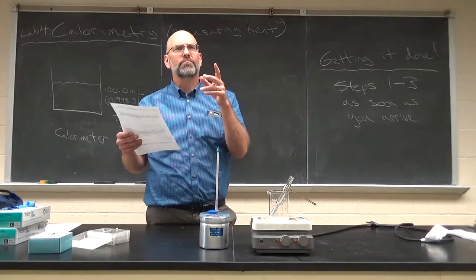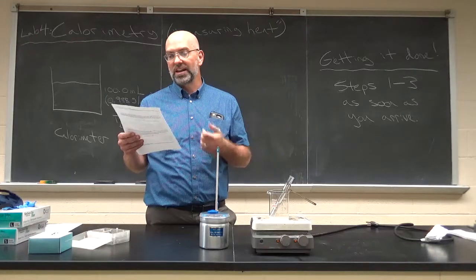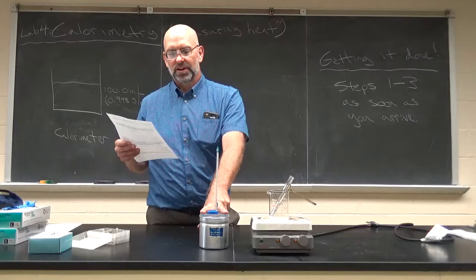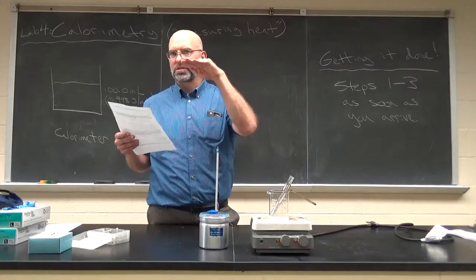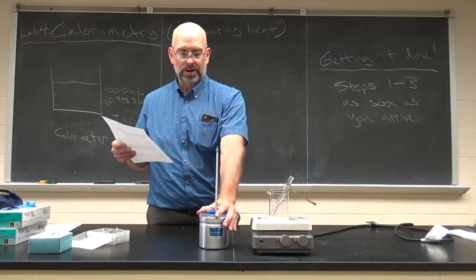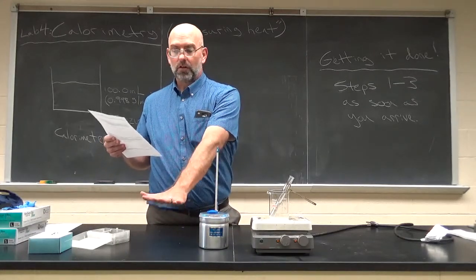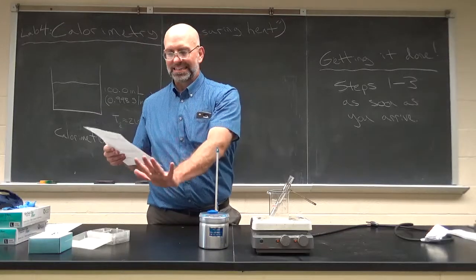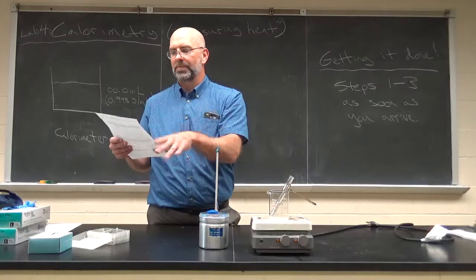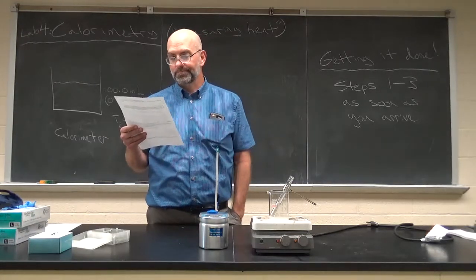Now, you can use tap water at the ends of the benches. That's perfectly fine. I don't really need to provide that to you, but you want to get that in here quickly so it has a chance to equilibrate to room temperature. So this is going for 15 minutes. Get your water in here. In fact, what might be good is to get a beaker of water from the tap and let it sit out at room temperature so it has a chance to warm up to room temperature after coming out of the tap. That's not a bad idea.